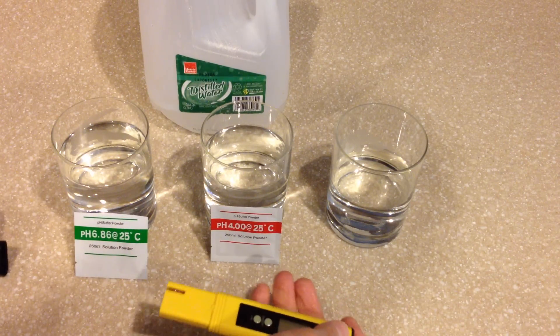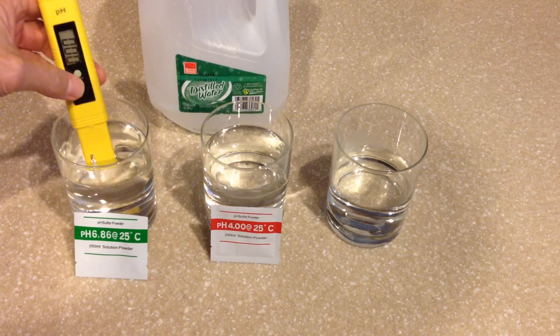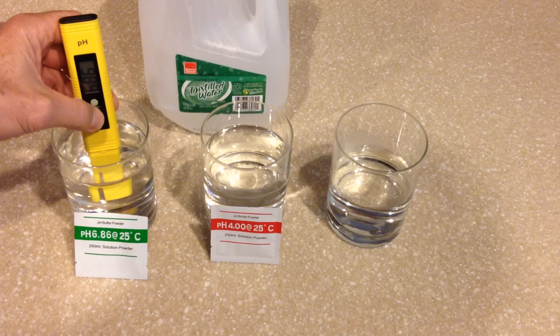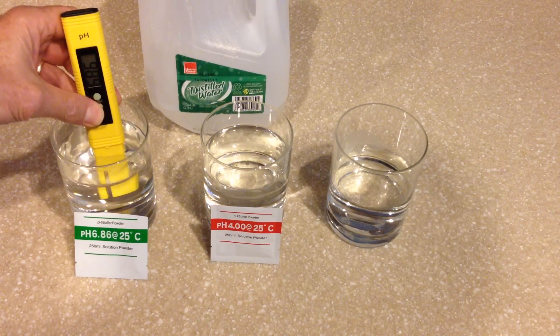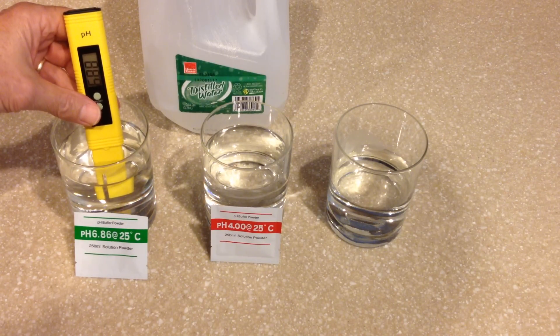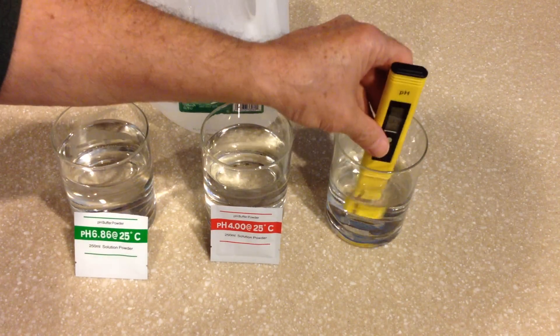So let's demonstrate how easily this happens. We're simply going to remove the protective cap, turn it on, insert the probe into the 6.86 solution, press the calibration button, hold it for three seconds and allow it to start to flash. It'll flash at 6.86, and once it stops flashing — there it is — it's stopped at 6.87, which is absolutely fine.